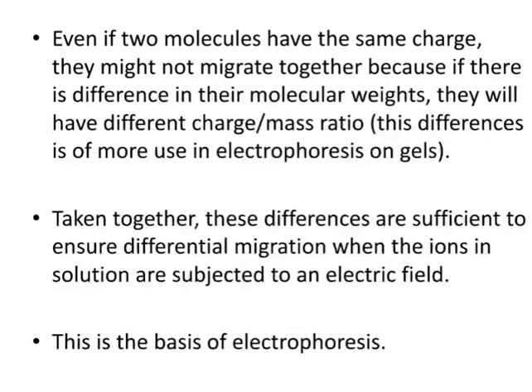So electrophoresis means separation of biomolecules not only based on the charge, but also based on the mass of that molecule. Taken together, these differences of charge and mass are sufficient to ensure differential migration when the ions in the solution are subjected to the electric field.